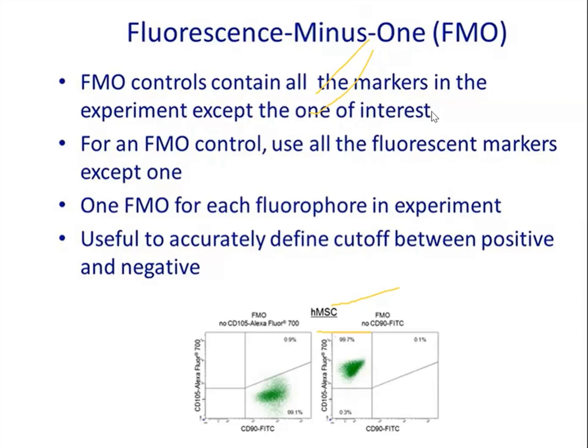If it is coming, you need to remove it. This removal is done automatically by the software, because it's a mathematical calculation and cannot be done manually. So you need to run different tubes for every fluorochrome you are using, and finally you eliminate all the spillovers. Then you get a perfect compensation, and the table you finally get is called the compensation matrix. I'll show you that.